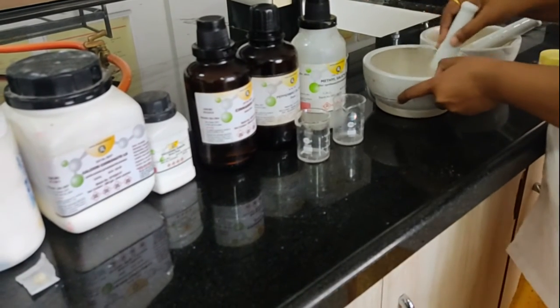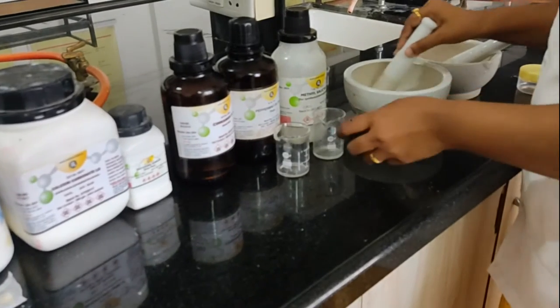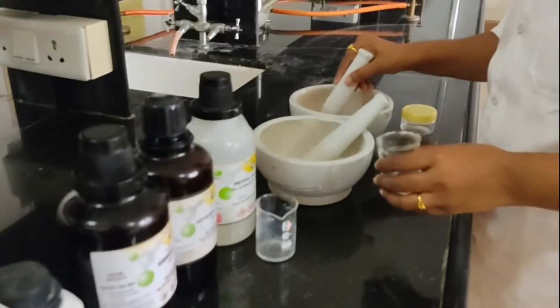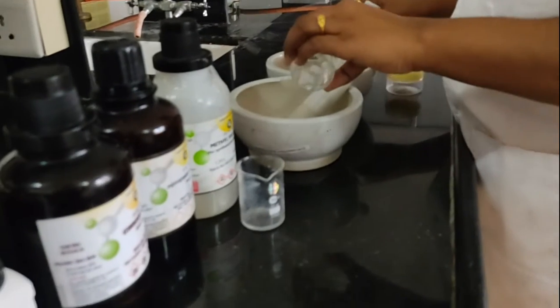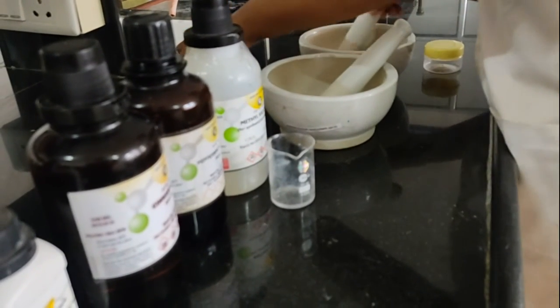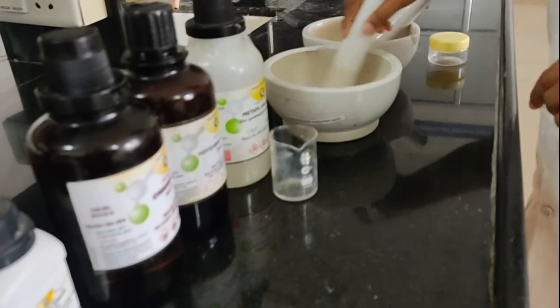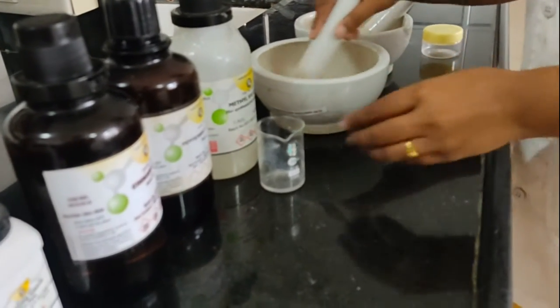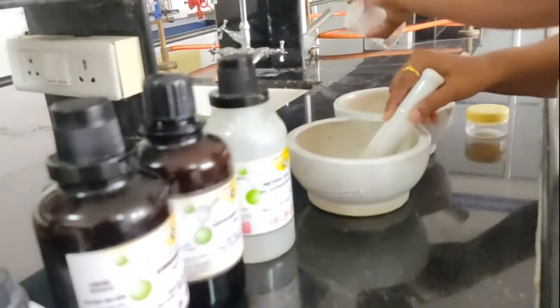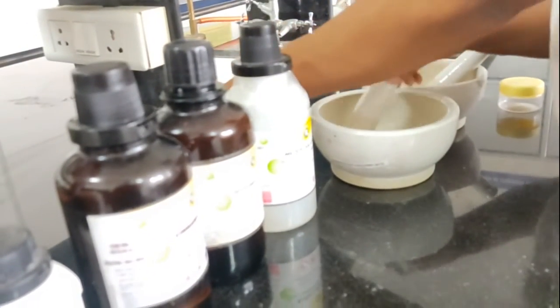Now I will proceed with trituration of it. Again, the next addition is the peppermint oil into the first mortar and also into the second mortar. Now again I am going to add the methyl salicylate into the first mortar and also into the second mortar.